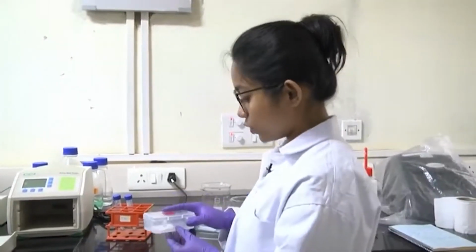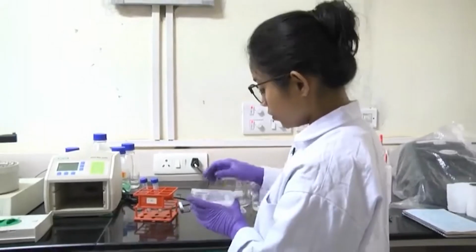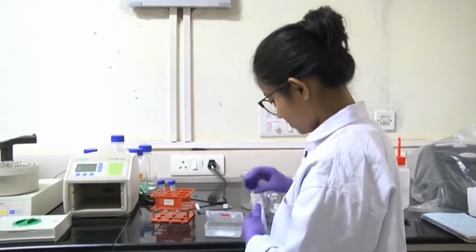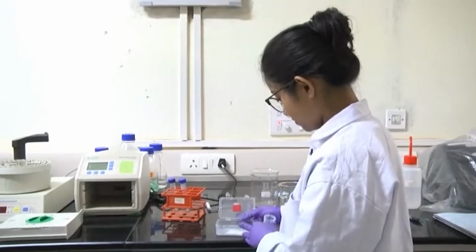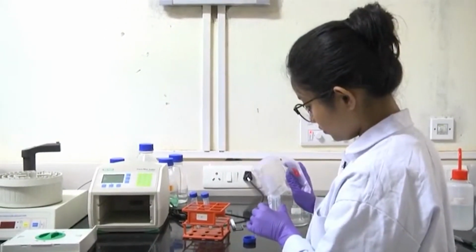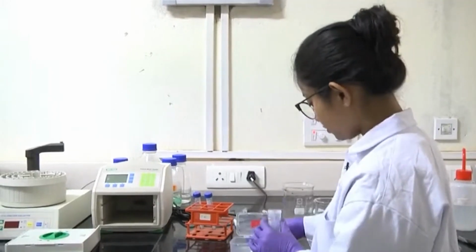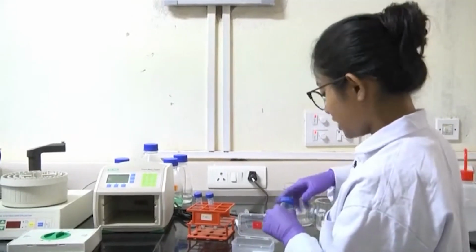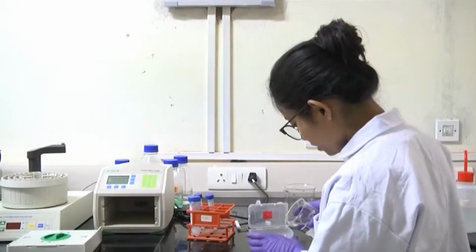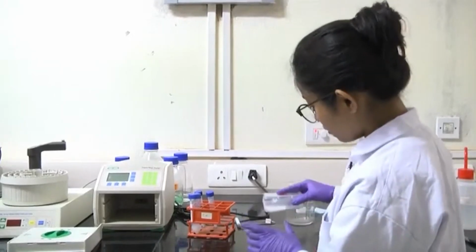So, it is 2 hours now and the blocking is done. I will remove this skim milk from the membrane. Then I will wash the membrane with 1x TBST buffer, the same buffer which we used to dissolve our skim milk.